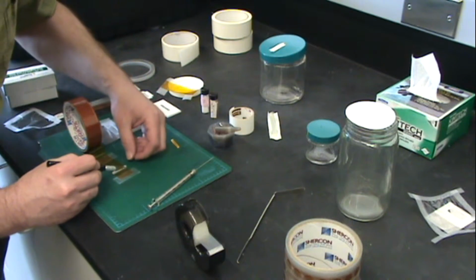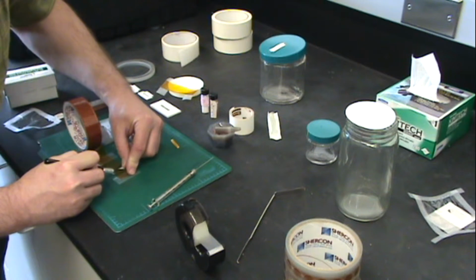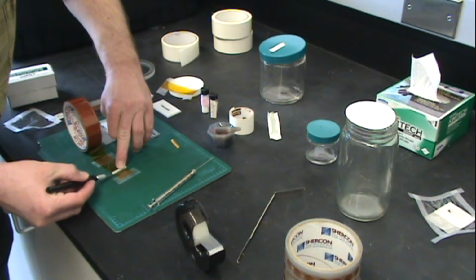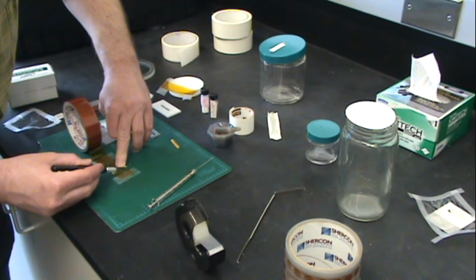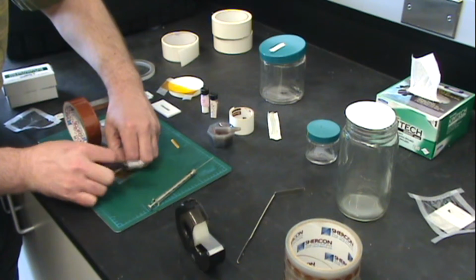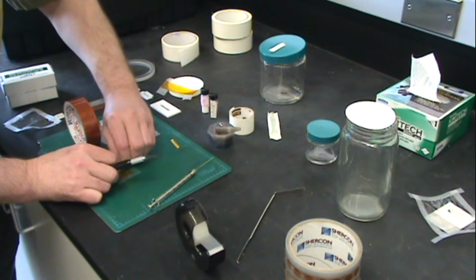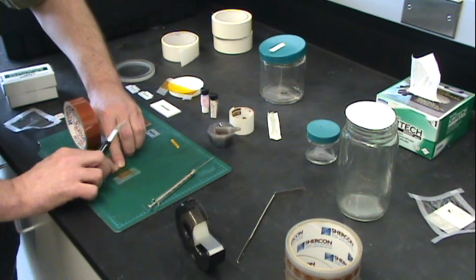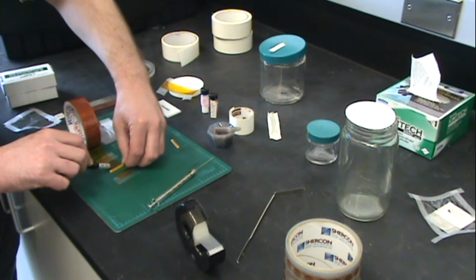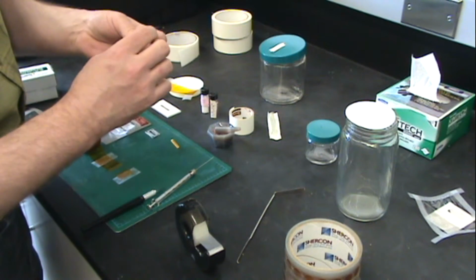And then the crucial step is to cut about 2 to 3 millimeters, slowly, parallel with the cell, and then while holding it down, fold it up, and that creates a nice seal on one side. Then you can just gently roll the cell around. It has a wide enough wall to create that seal, and down the back, then cut out, and practically the cell is ready to go, nicely wrapped.